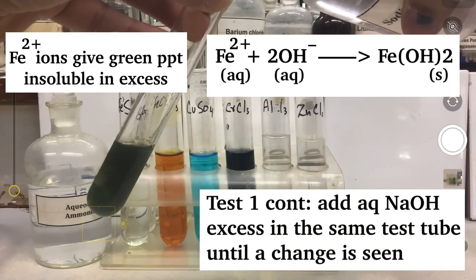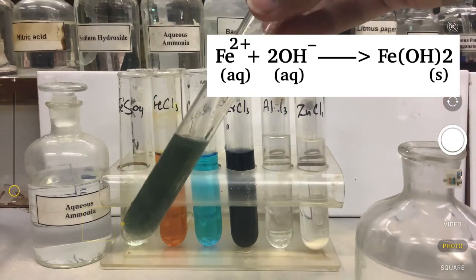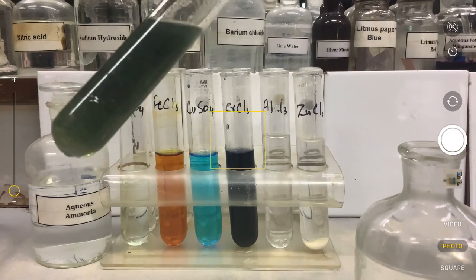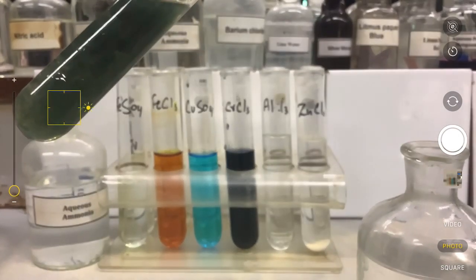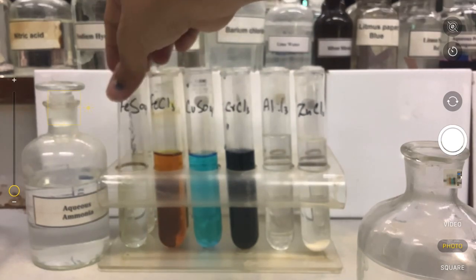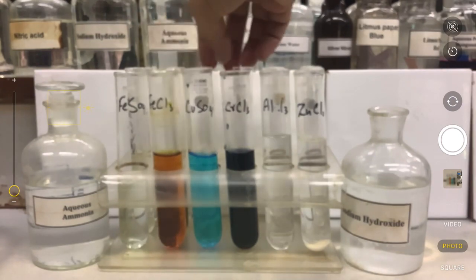If you continue to add excess sodium hydroxide in the same test tube, iron 2 ions will give you insoluble green precipitates, as you can see. These green precipitates are insoluble in excess no matter how much sodium hydroxide you add. So this is the test for iron 2. Let's perform the same test with aqueous ammonia, and let's see what happens.